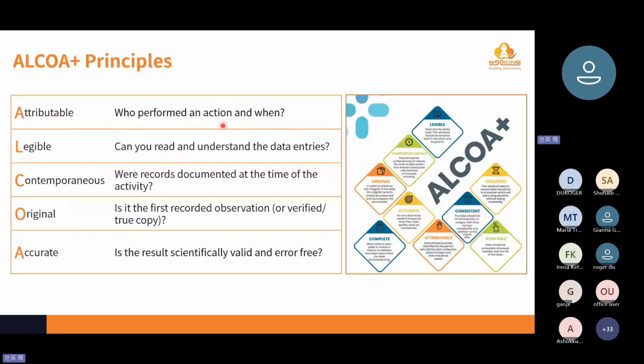The WHO and FDA introduced and still use ALCOA plus principles to ensure data integrity. As well as being crucial for compliance reasons, ALCOA+ principles are becoming increasingly important to GMP. A represents attributable. It means all paper and electronic data must be attributable to the person generating the data, including who performed an action and when.